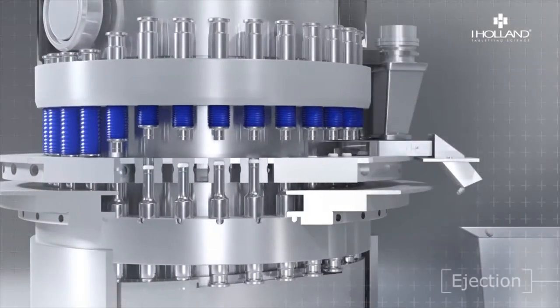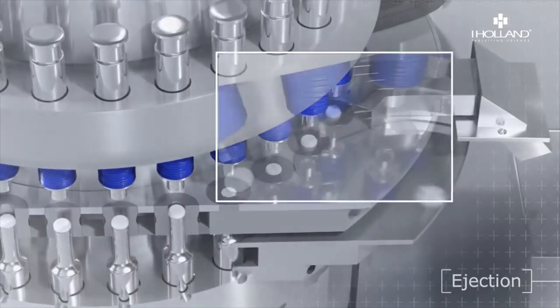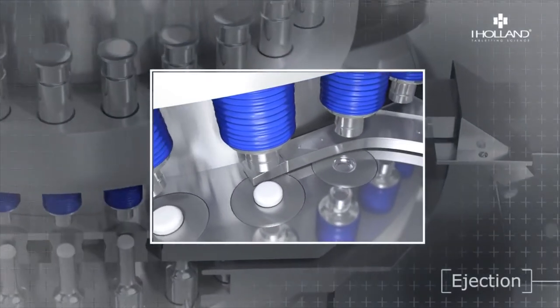After compression, there is the ejection cycle. The lower punch pushes up, ejecting the tablet from the die.